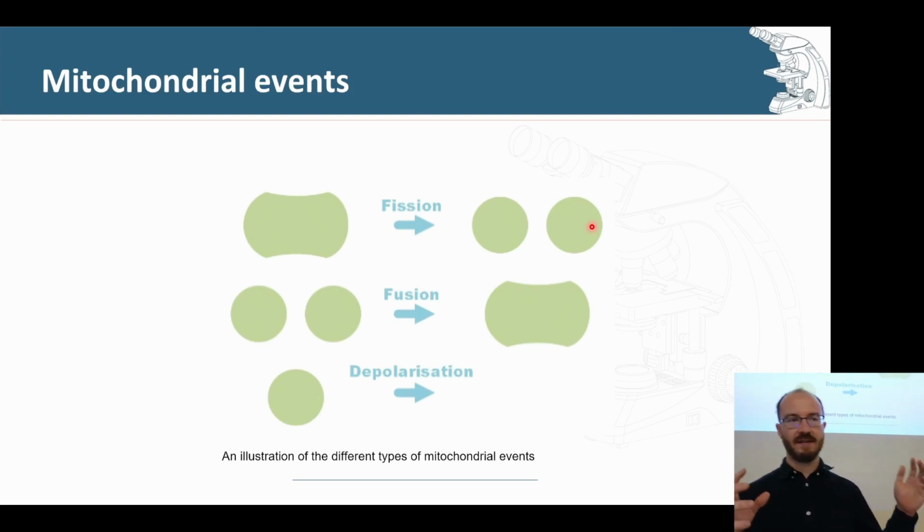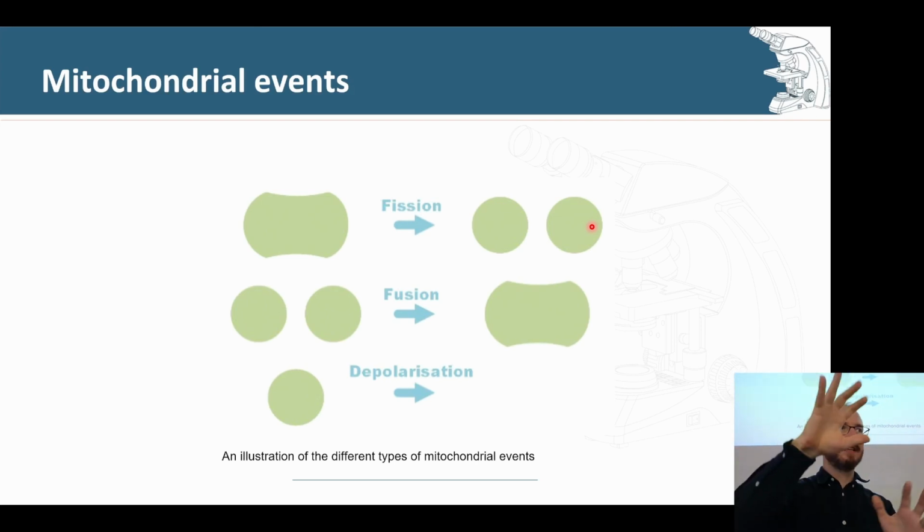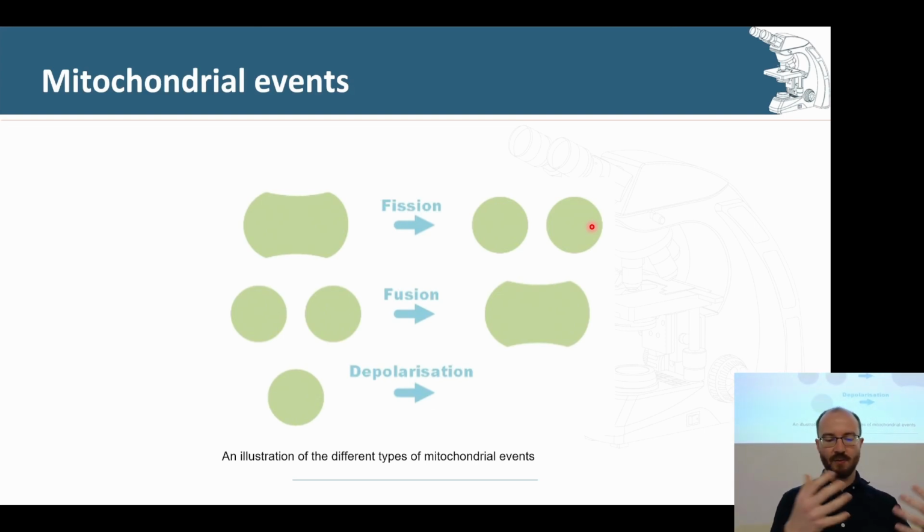In fission and fusion, what I consider fission and fusion is where I've got 2 mitochondrial structures, and maybe let's just define that. A mitochondrial structure is where I've got lots of mitochondria that are already connected together. So they've already formed a network, but they are disconnected from the rest of the mitochondrial network. So then those would be 2 distinct mitochondrial structures. It could also just be a single mitochondrion floating around. That would also be a mitochondrial structure. It could be a little bit of an elongated filament that's floating around. Anything that is separate from anything else, I consider a mitochondrial structure. So I want to know, where do these things, mitochondrial structures in my cell, where do they join? Where do they break apart? Where do they fuse? Where do they undergo fission?